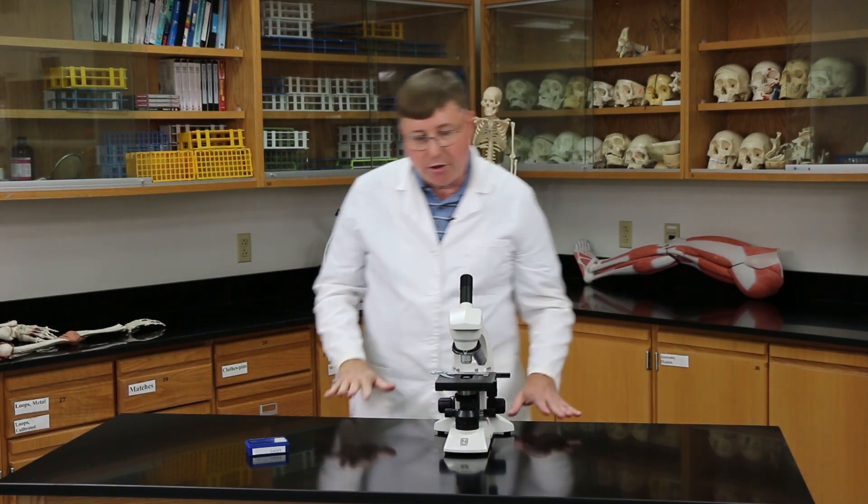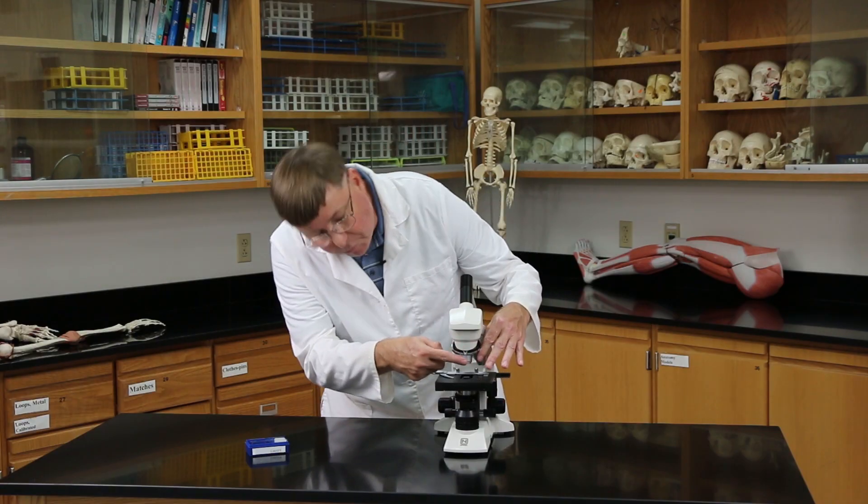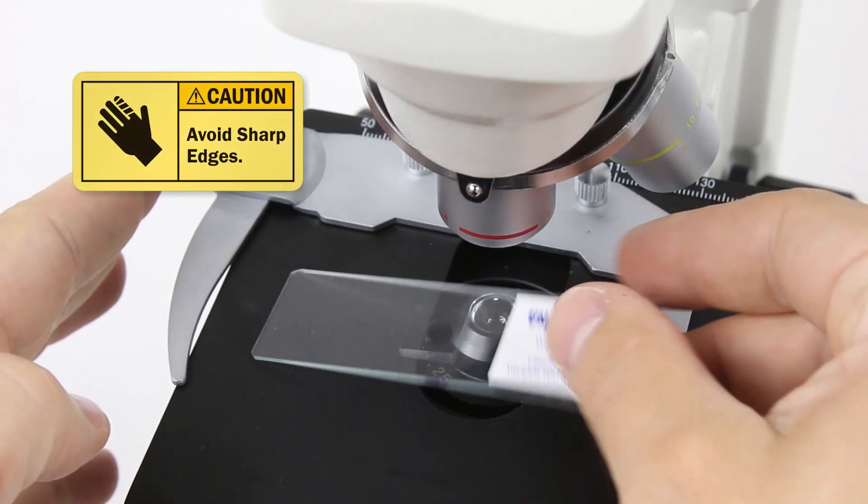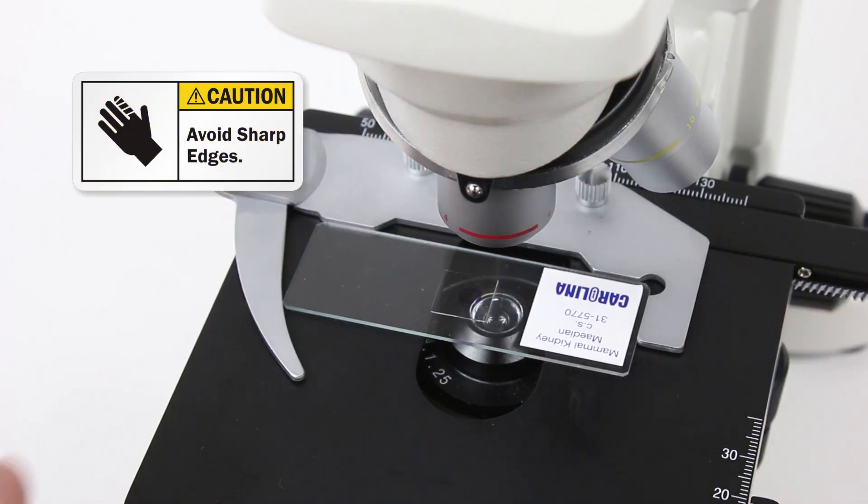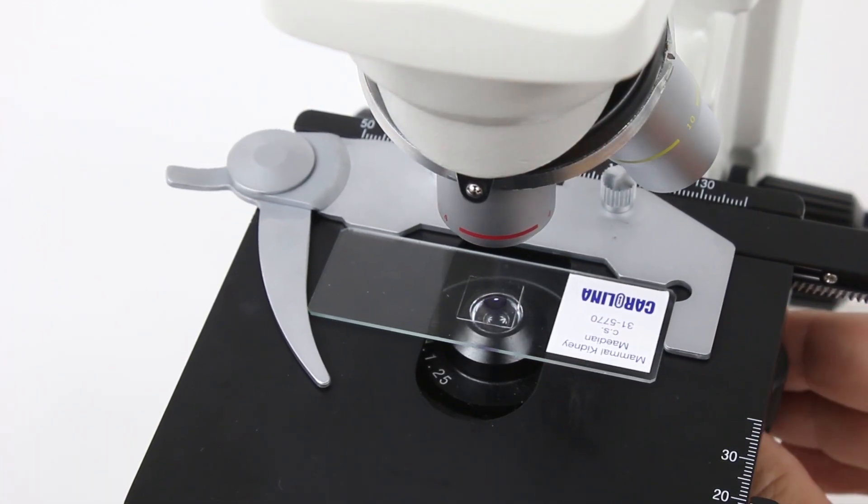Now, how about putting a slide on the microscope. So what I'm going to do is I'm going to make sure that I'm on the scanning lens. That's the red one over here. And I'm going to get a slide. And I'm going to pull back the stage clip and gently slide that slide into place.